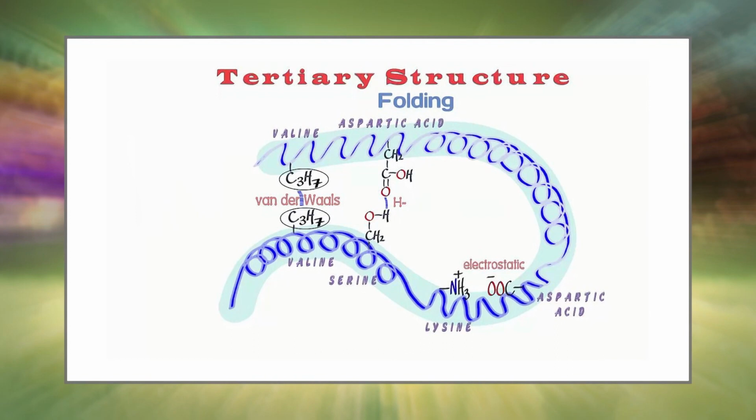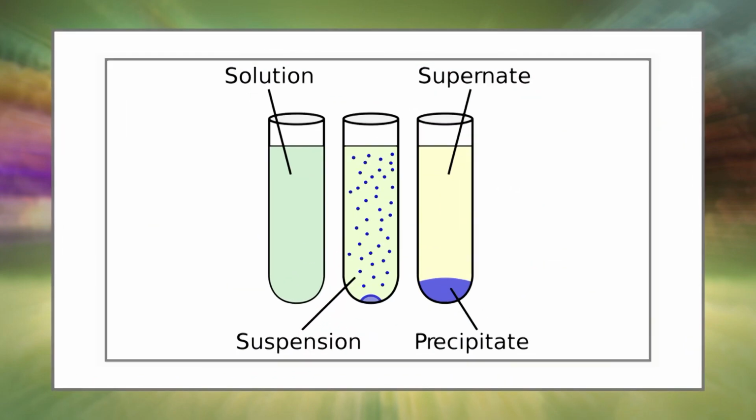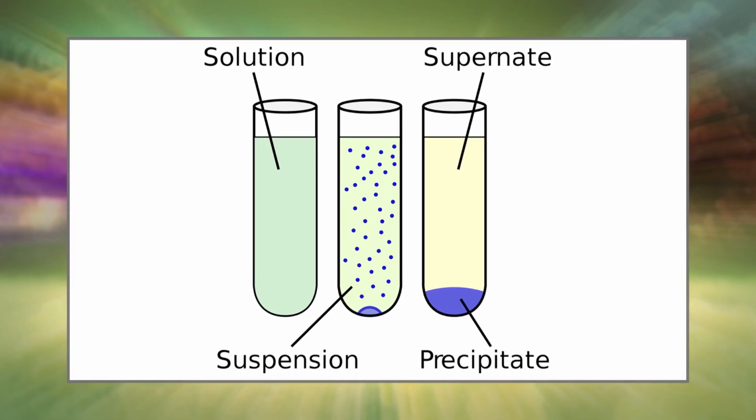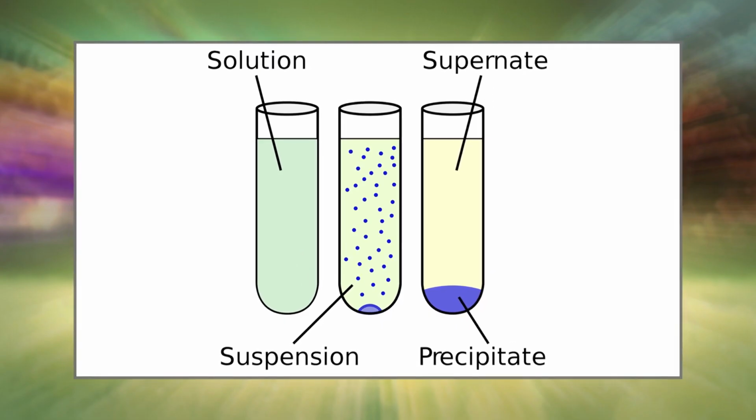Precipitating or denaturing fixatives act by reducing the solubility of a protein molecule and often by disrupting the hydrophobic interactions that give many proteins their tertiary structure. The precipitation and aggregation of proteins is a very different process from the cross-linking that occurs with the aldehyde fixatives.